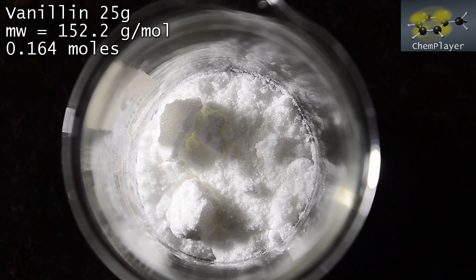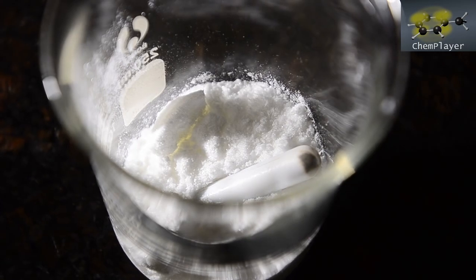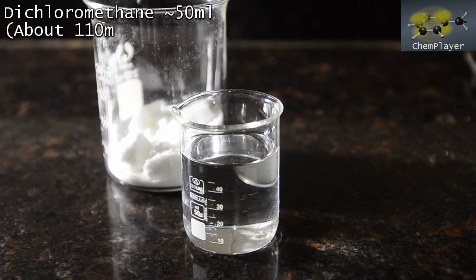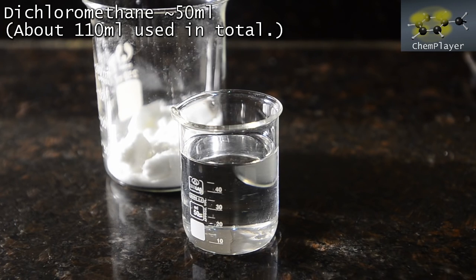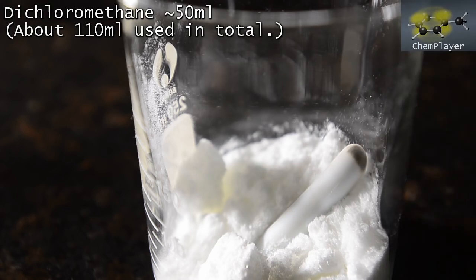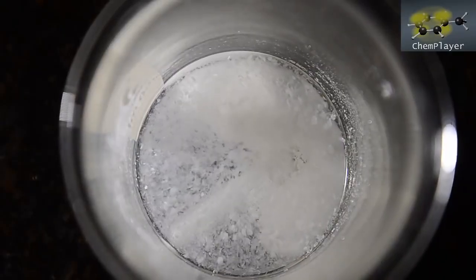Here we've weighed out 25 grams of vanillin powder into a 250 ml beaker. Let's get a stir bar in. Now we're going to dissolve the vanillin in a solvent — we're going to use dichloromethane because it dissolves it fairly well, and also because it shouldn't react with the nitric acid we'll be using. Here's about 50 ml of dichloromethane to start with, though as you'll see we needed a bit more. Let's get this set up on a magnetic stirrer and start stirring.